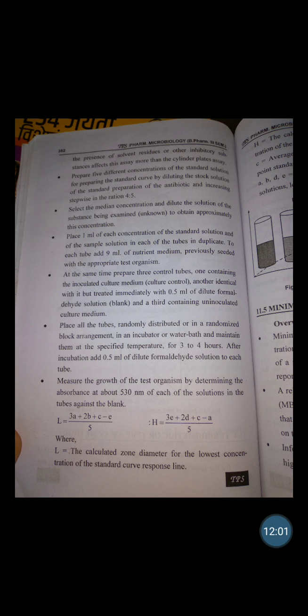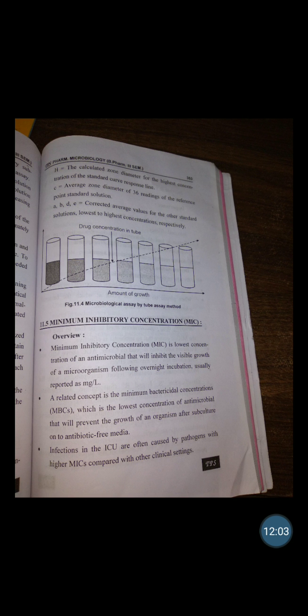C is the average zone diameter of 36 readings of the reference point standard solution, and A, B, D, E are the corrected average values for the other standard solutions, lowest to highest concentration respectively.